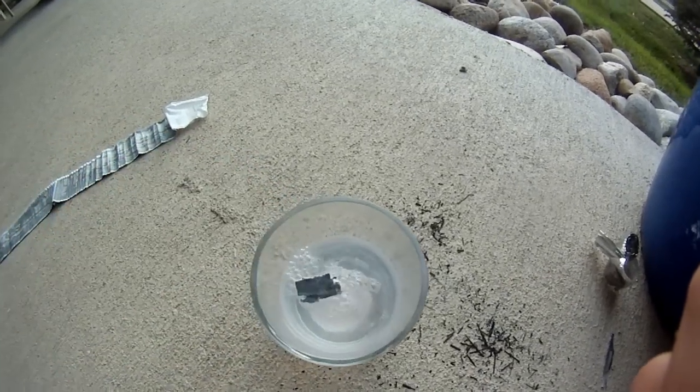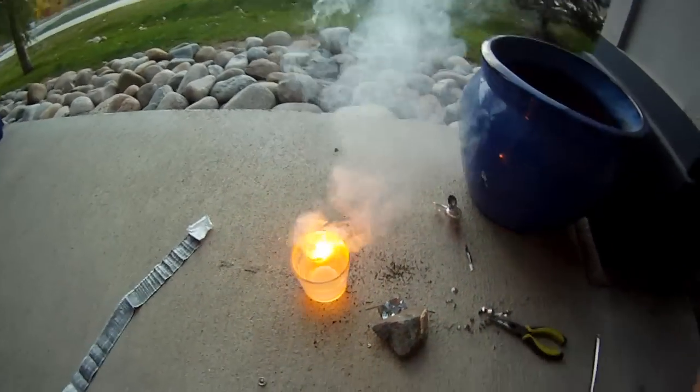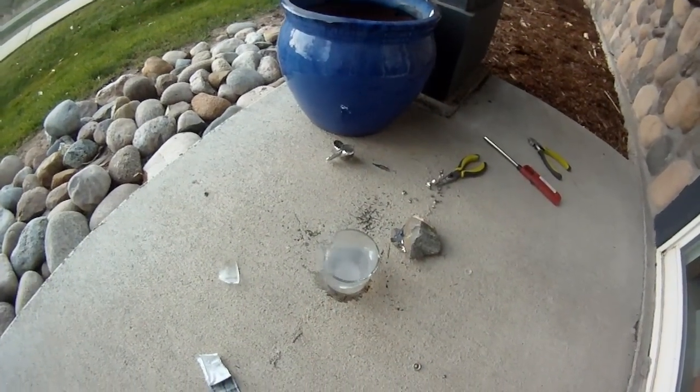This is One Bad Idea, and today we're going to be doing experiments with elemental lithium to explore its chemical properties and how it bonds with other elements.